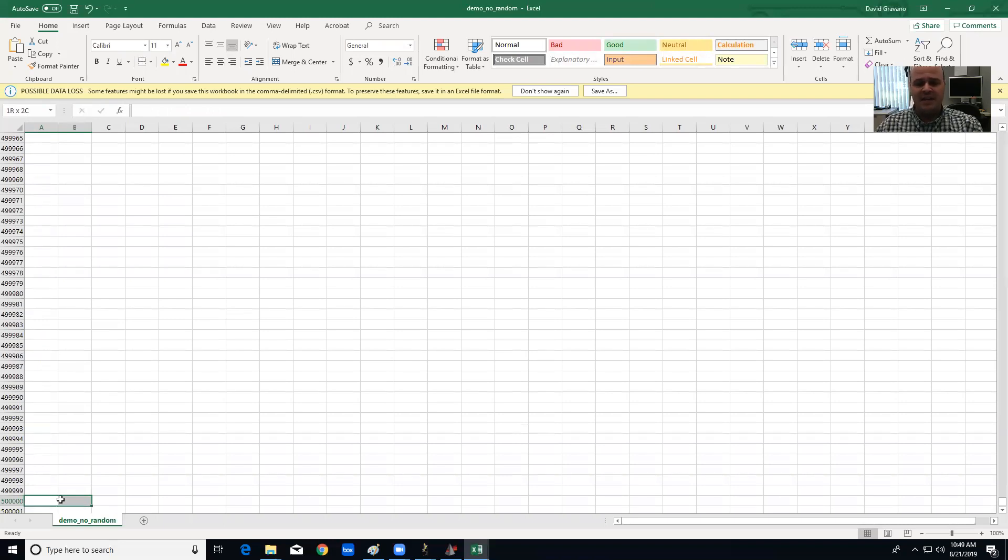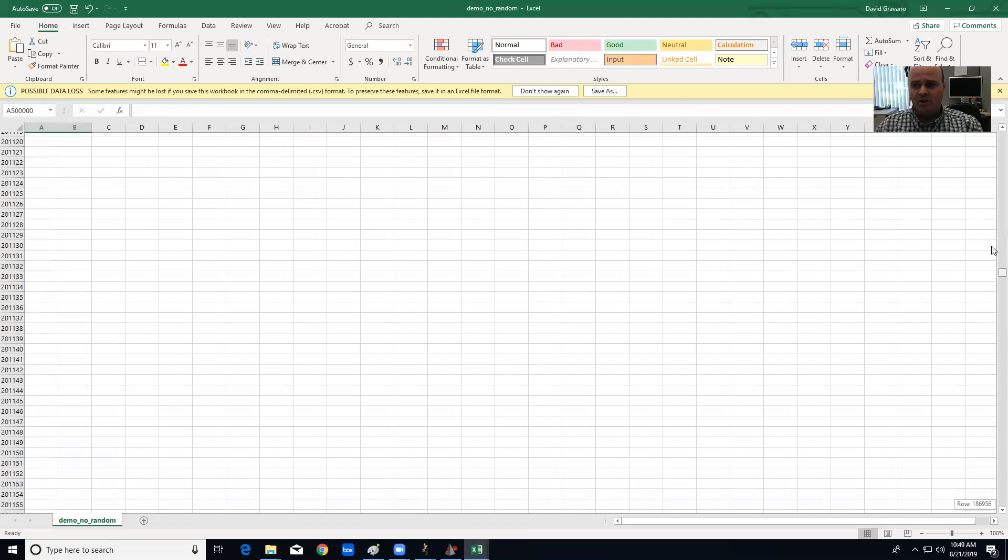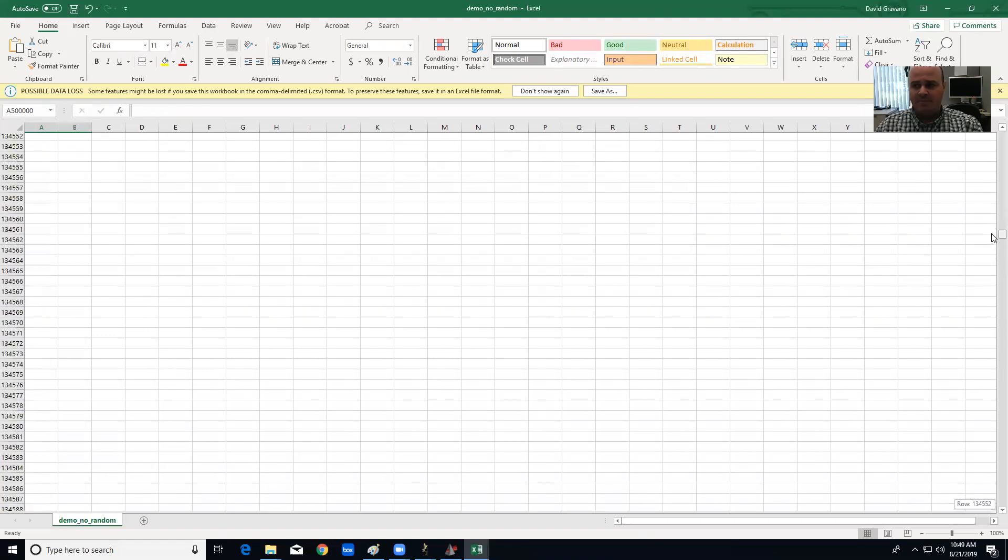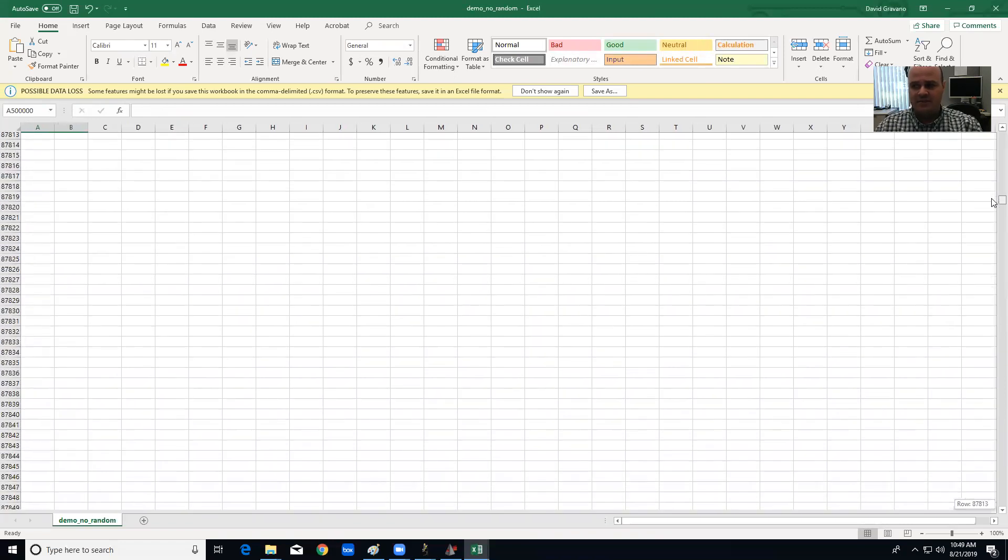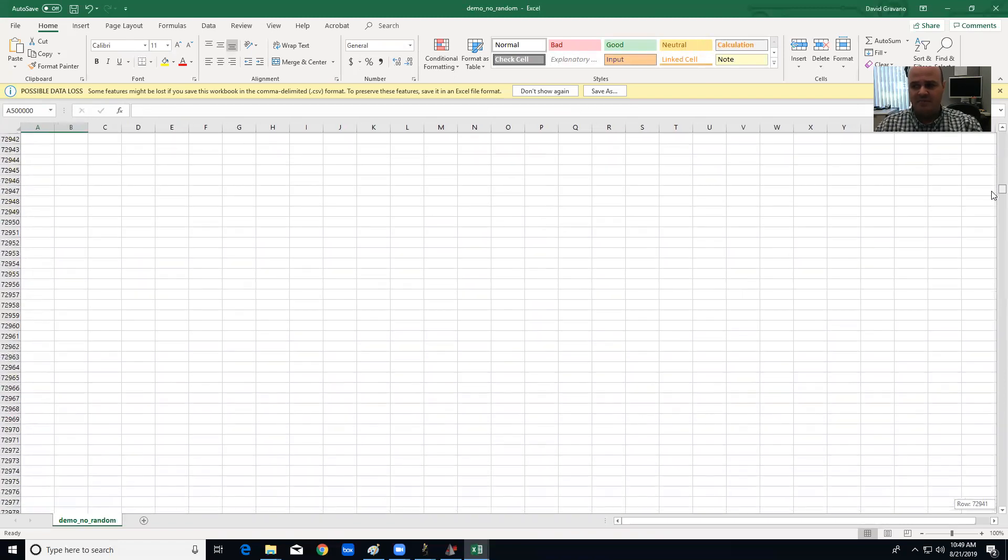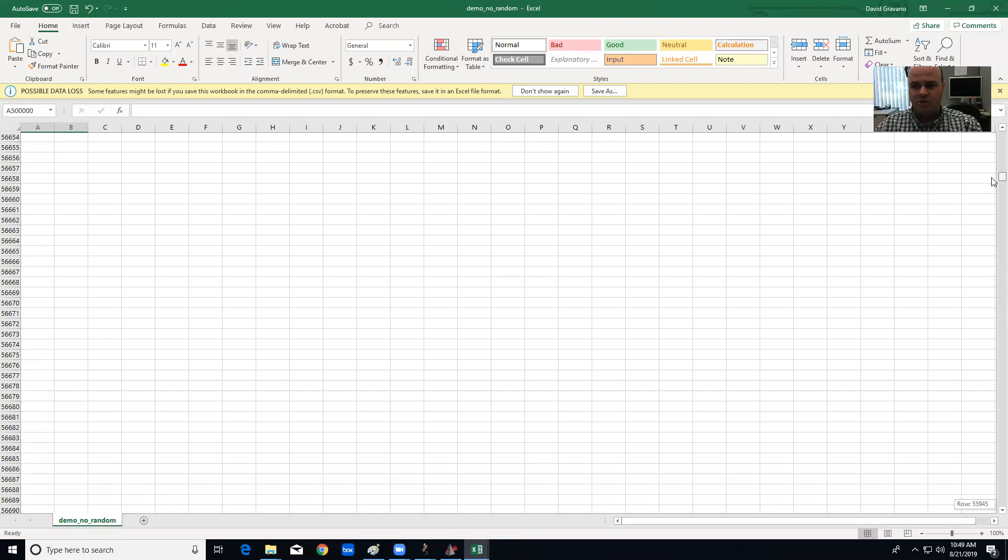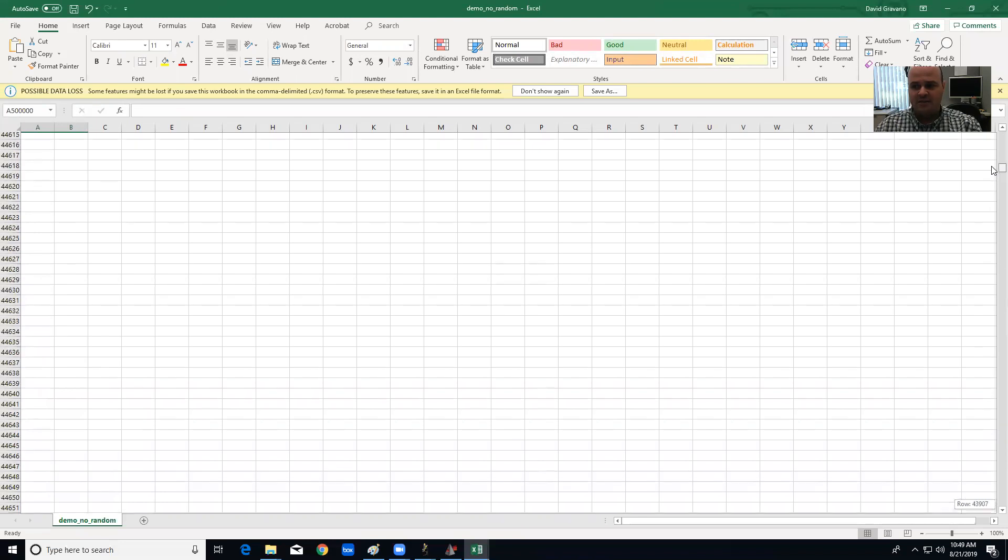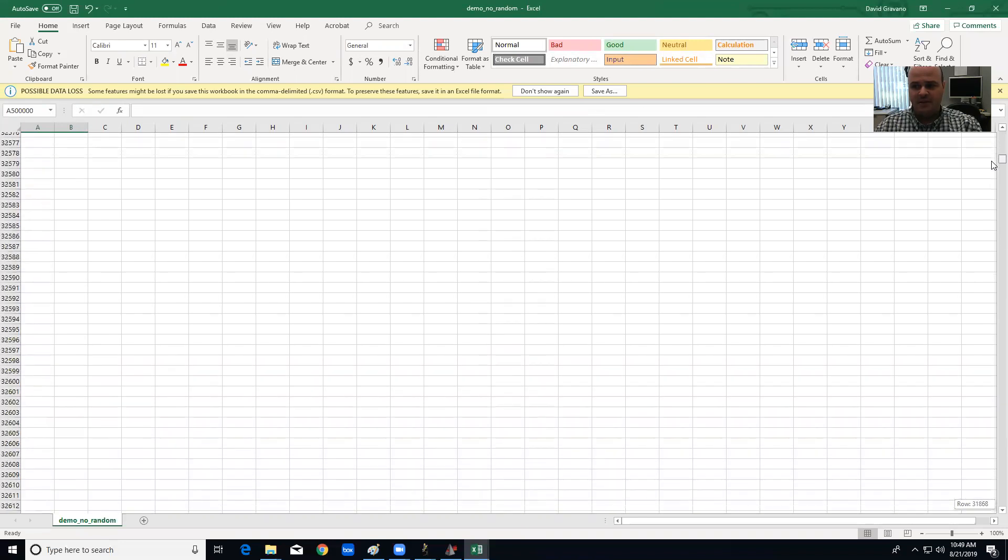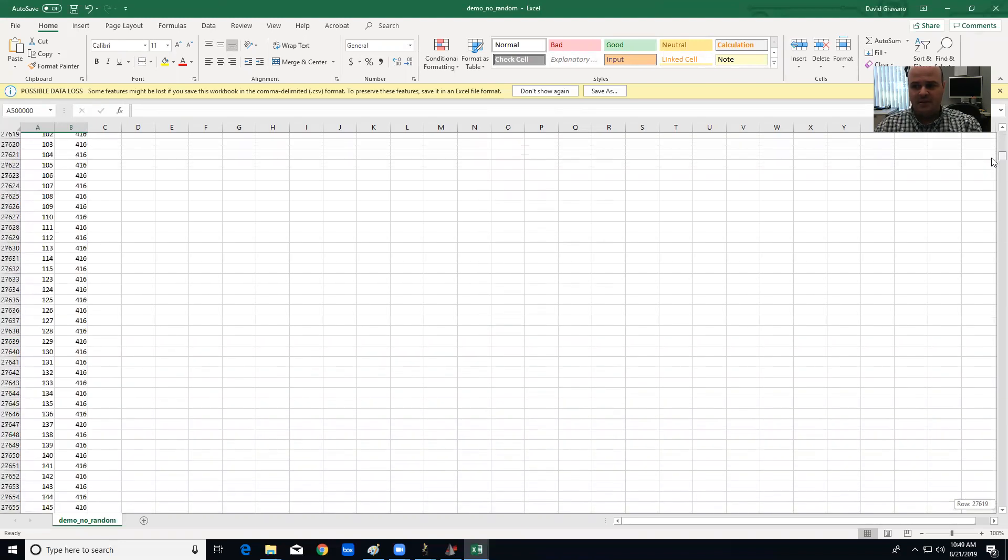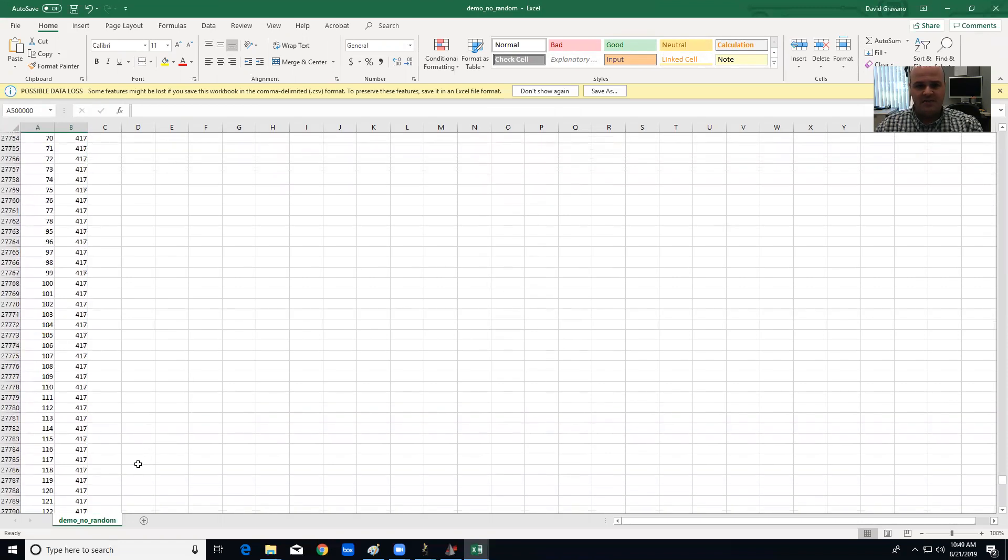And what I'm going to do now is highlight both columns A and B of the 500,000th row. I'm going to scroll all the way back up to my 20,000th row. This could be a little tricky to do, 29,000.